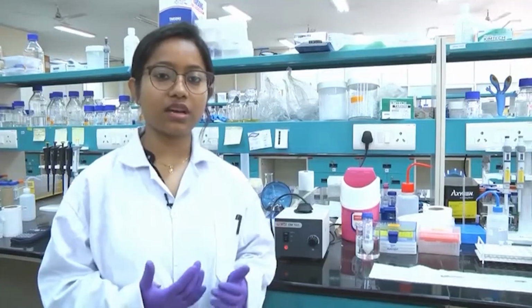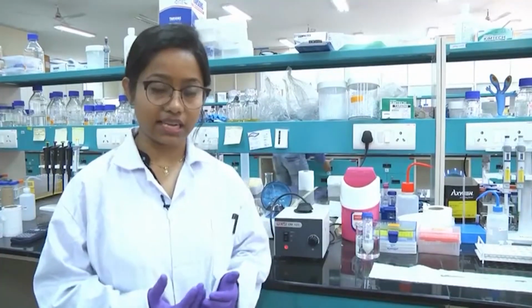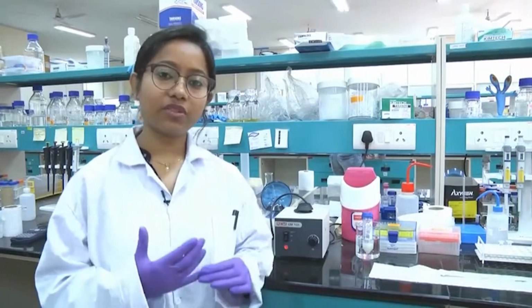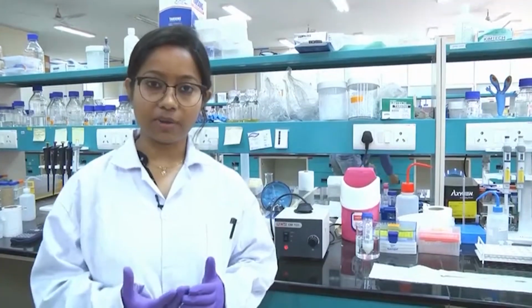As we are isolating the protein from bacteria, first you need to express the protein inside the bacterial cell. For that, the basic steps are that you grow your bacteria in normal LB, or for a specific need in M9 or other minimal media. First try to do it in an enriched medium like Luria Bertani or LB medium. When you grow the bacterial cells, there will be a huge number of them, and then you need to express the protein. Mostly we follow an IPTG induction based technique, where we provide IPTG. I will go through the basic steps of how you can overexpress your protein inside the bacterial cell.